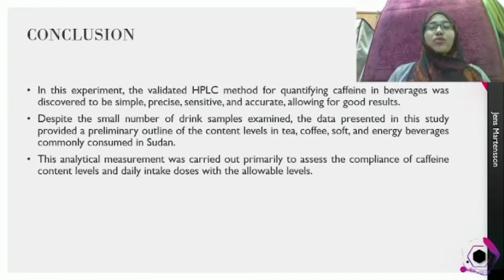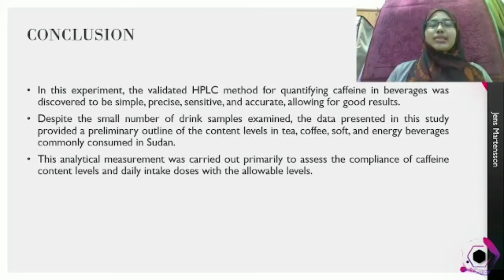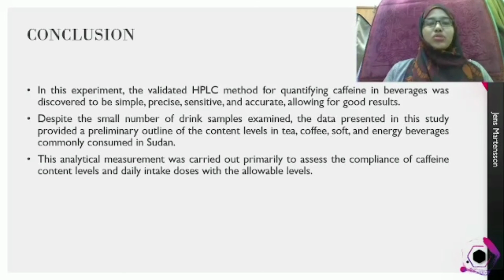My name is NurHanani Fatiha binti Azhar, and I'll present the conclusion for experiment 6 in this slide. In this experiment, the validated HPLC method for quantifying caffeine in beverages was found to be simple, precise, sensitive, and accurate, allowing for good results.